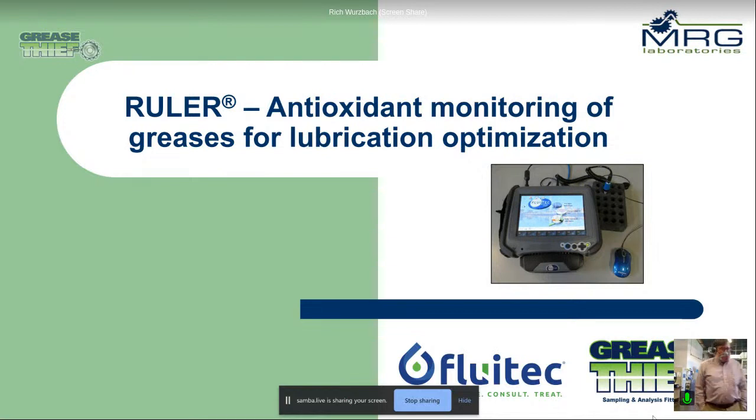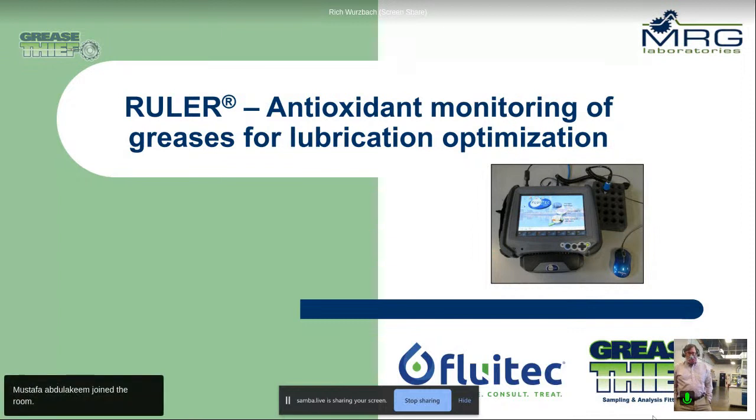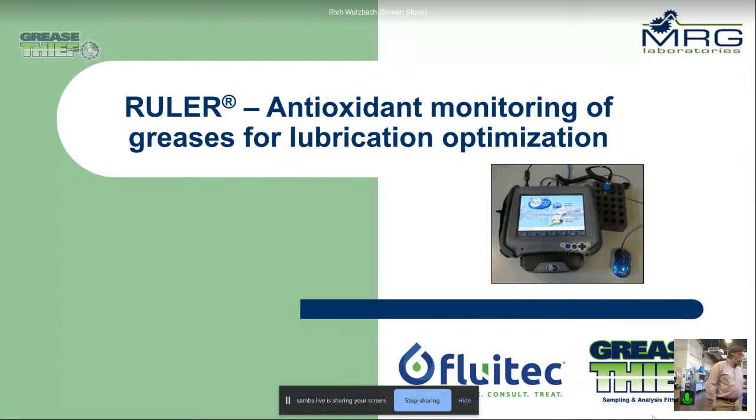But it's come a long way, and in addition to having that history of being able to evaluate antioxidants, especially in, let's say, turbine oils and other large reservoirs where we use it as a tool to get the maximum life out of those oils, we've started using it more so for greases. And that's what I'm really going to focus on here today: the ruler as a tool to monitor antioxidant formulations in greases for lubricant optimization.